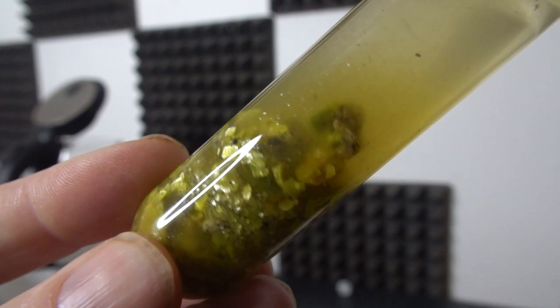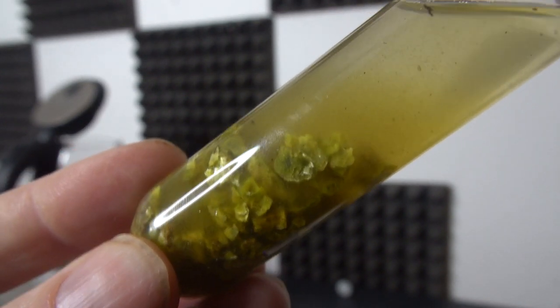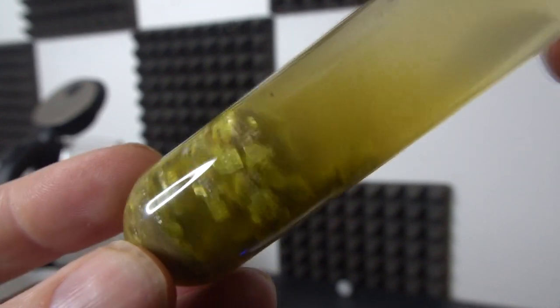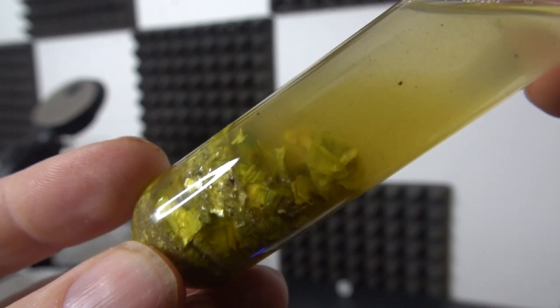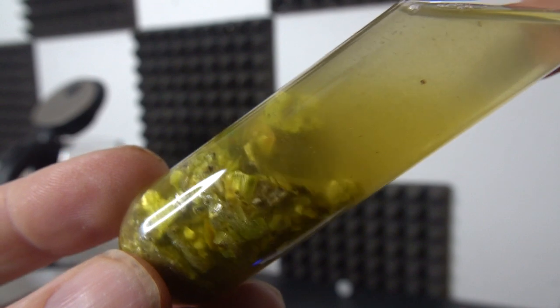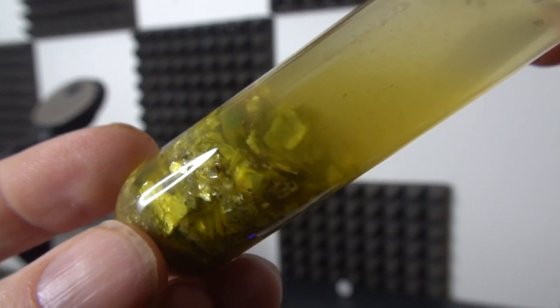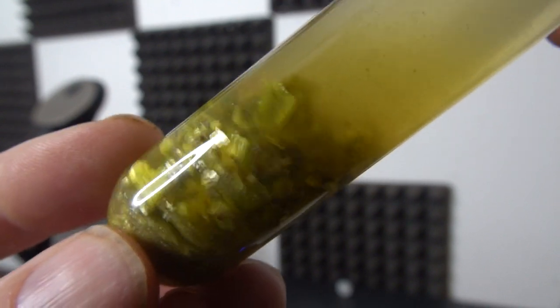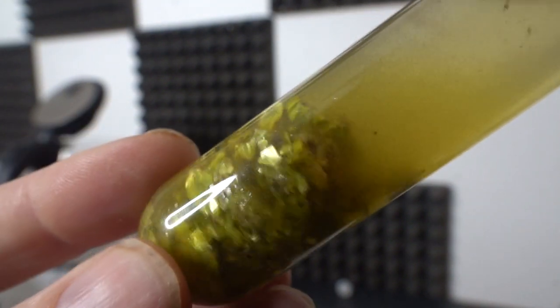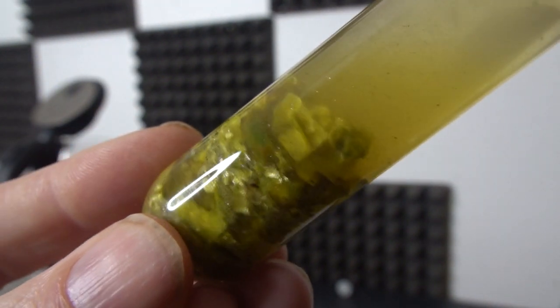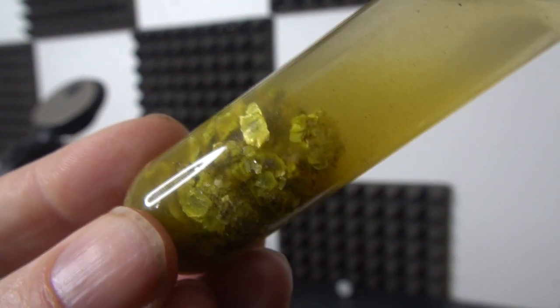But my reckoning is I think the best chance that I have is to dissolve it in lithium chloride, right? So I take this uranium oxide which I'm going to get out of this, I dissolve it in lithium chloride, molten lithium chloride at about 650 degrees Celsius, over a thousand Fahrenheit, and then I electrolyze it to get my uranium. And the reason I'm doing it by electrolysis is because it'll be a fairly clean method. And then at the last point I'm gonna have to find some way of casting the metal into a ring. That's really challenging.